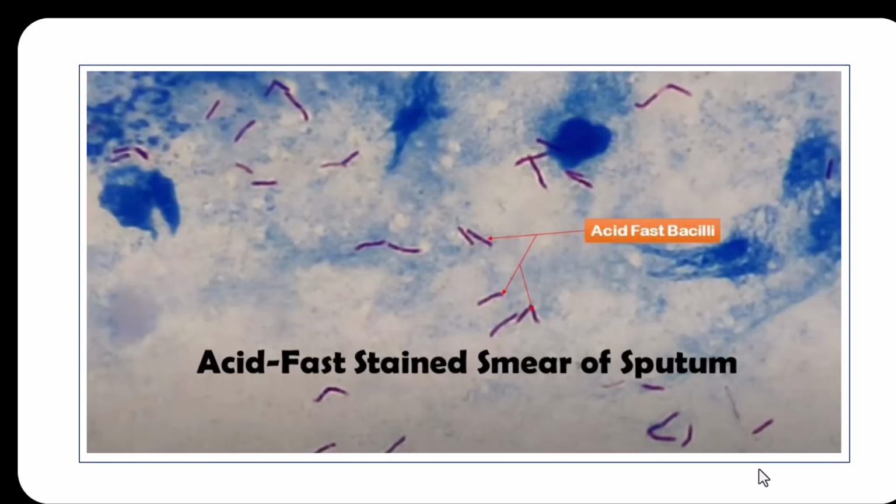This image is the outcome of the Ziehl-Neelsen stain, which shows that the acid-fast bacilli are visible as red to pink rods that keep the carbol fuchsin stain because of their waxy cell wall, while the background with non-acid-fast organisms is stained blue, taking the methylene blue color, the counter stain. This rapid result is essential for identifying pathogens like Mycobacterium tuberculosis in a sputum smear.